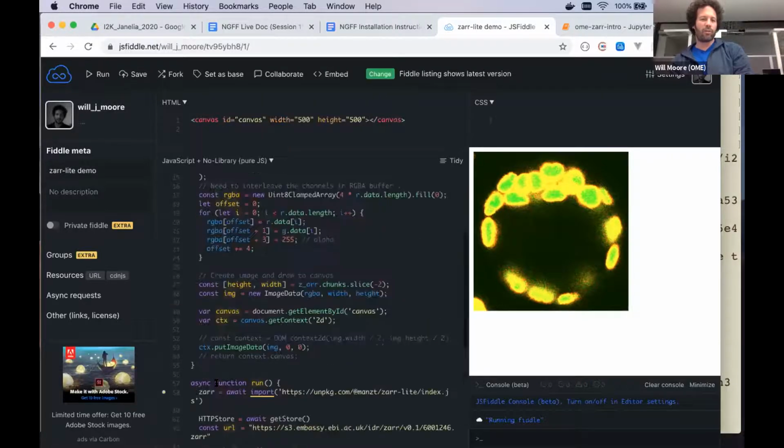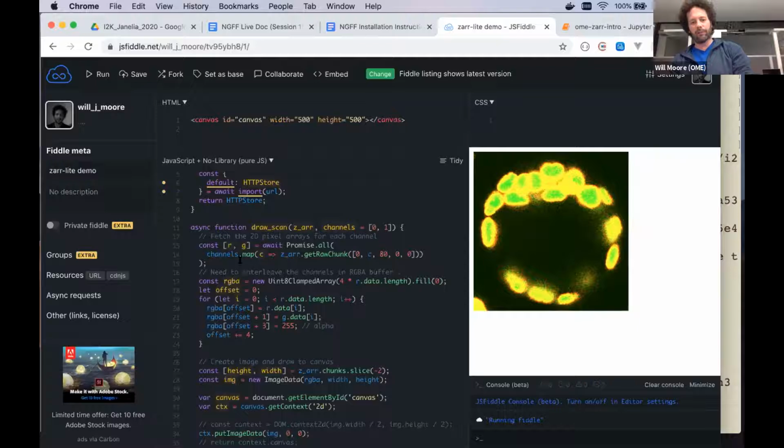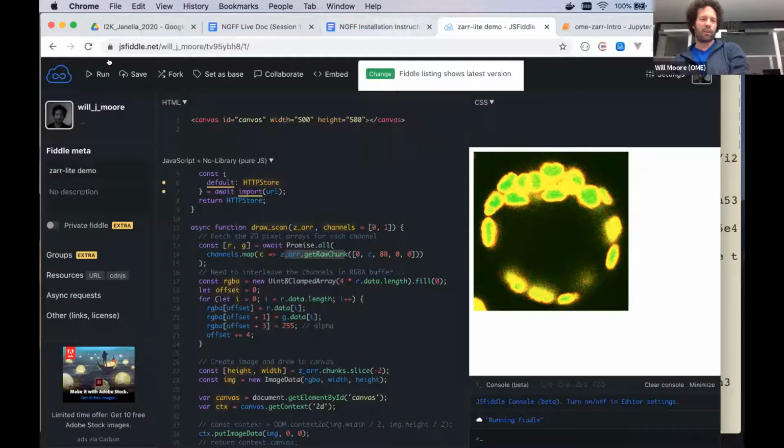This draw method here basically gets the raw data for the dimension that we're interested in. Here are the 5 dimensions, and it's just rendering that. It's just reading the pixel data out of that, and then applying that to a canvas, so we can see the RGB values on that canvas. This is saturated because we're actually reading 16-bit data and applying it to an 8-bit image.